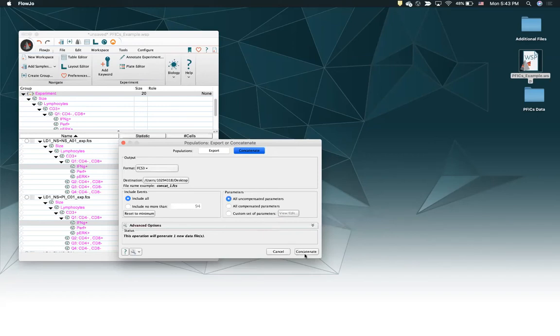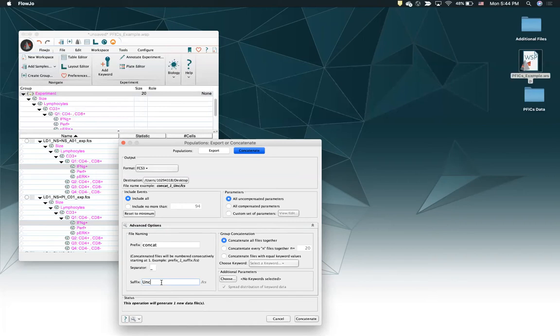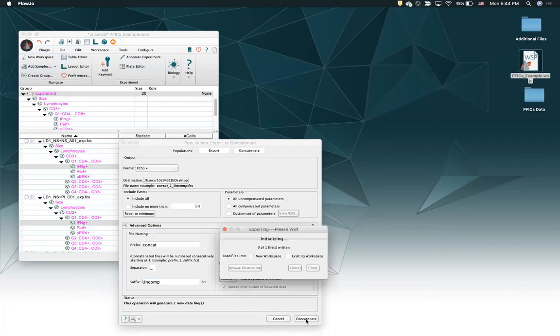First, let me concatenate with uncompensated parameters. I'm going to give it the suffix 'uncomp' so we know it's the uncompensated one. I'm just going to do it like that, so I'll go to my desktop. We'll put it in the existing workspace.